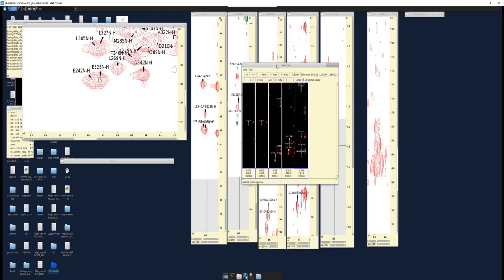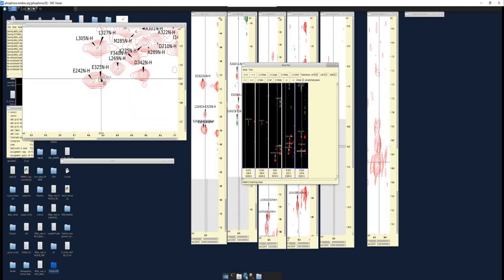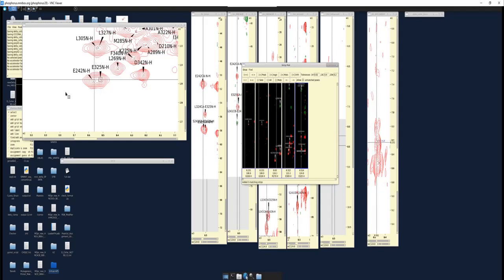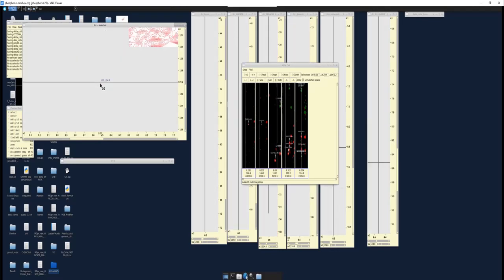Now, if we look back, our glycine was at 8.25. And we can see here at 8.25, it's a pretty good match, right? So here you have your I peak at around 8.5, and at 8.25, you have the glycine, which is the I-1, right?